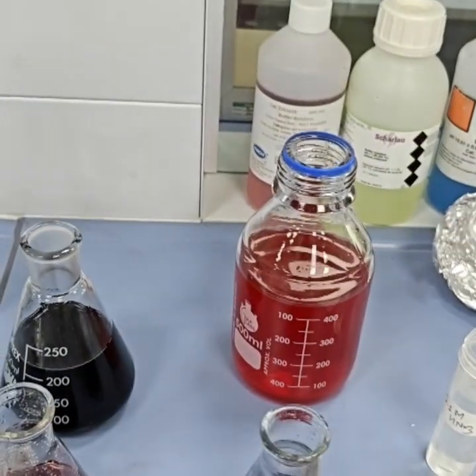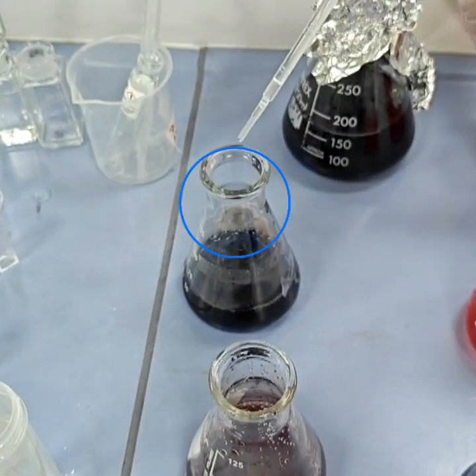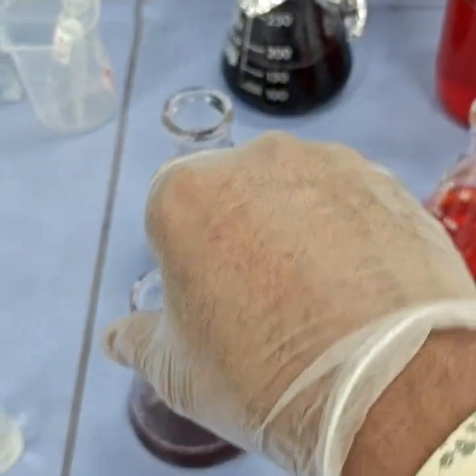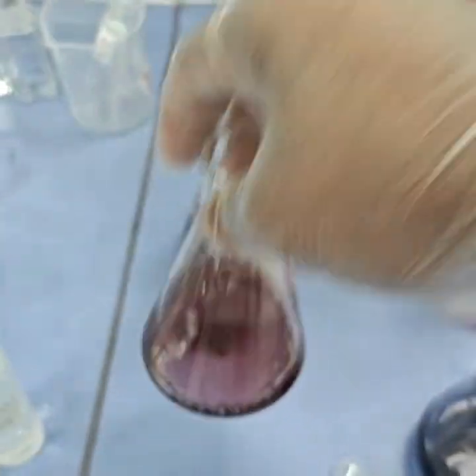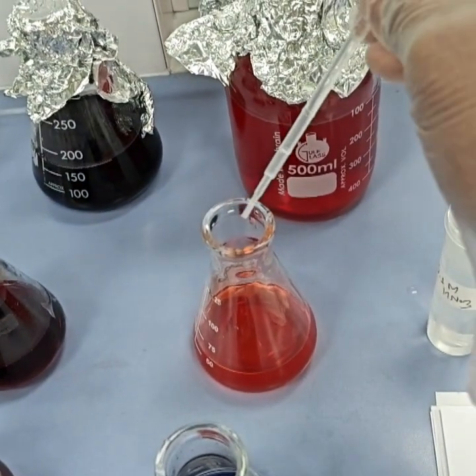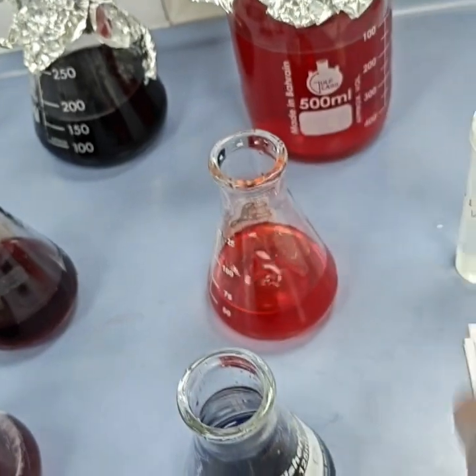Now we will see the same thing by adding base. Let me add base first to the EBT. You could see the color has entirely changed. Here there is more tint, so this is slightly purple, and this is also purple, but the color is a bit lower in tint. And if I add base to the Congo red, you could see the color has changed, but there is a shift.